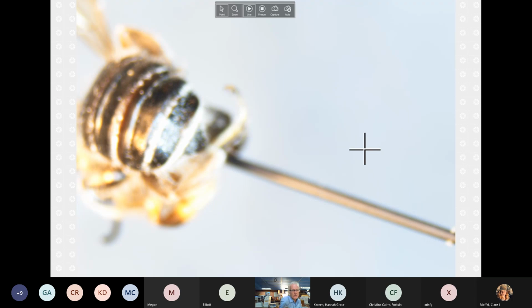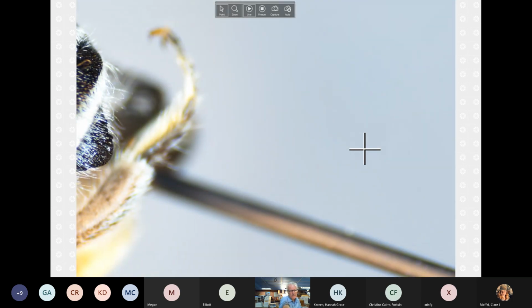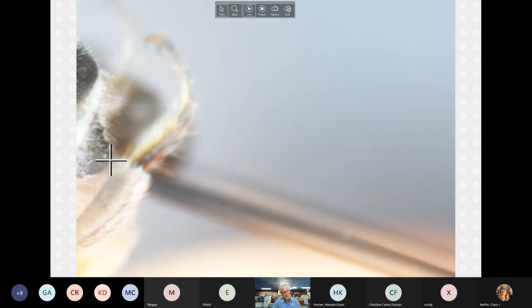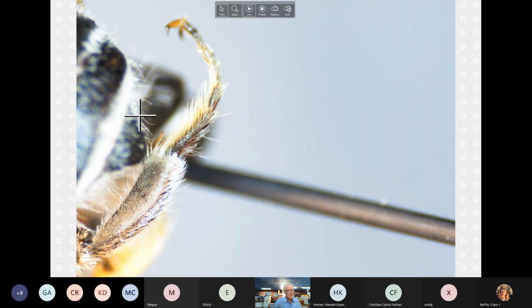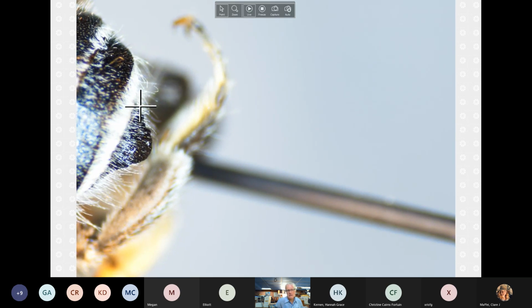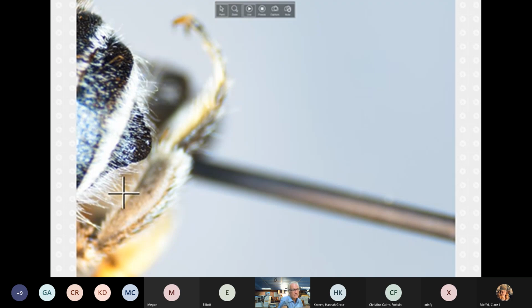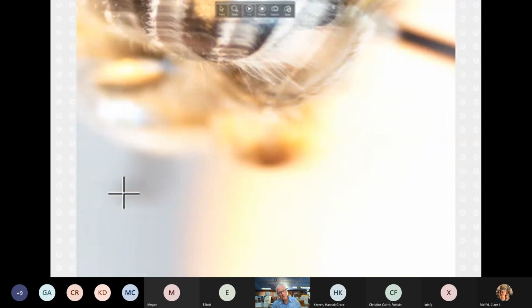All right, so we're looking at T6. Here's the flange. We're not going to look underneath it for the true rim, but if you recall on the other one, it's wider, and it has a clear notch in the middle. This is the opposite, so it's convex, and it's pretty much got a smooth outline, and there's no sense of a divot or anything in there. So that's a nice character. That's why these are all on the front page.